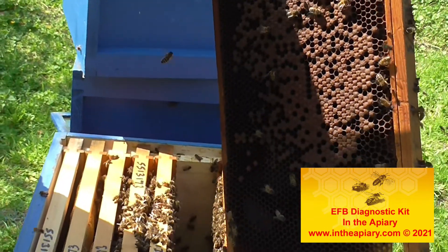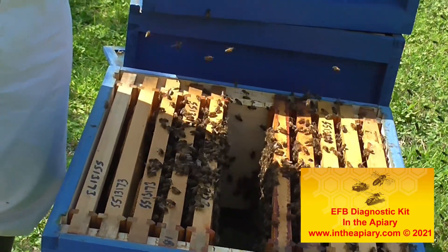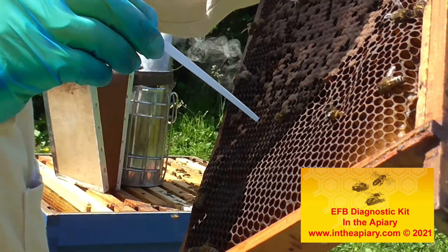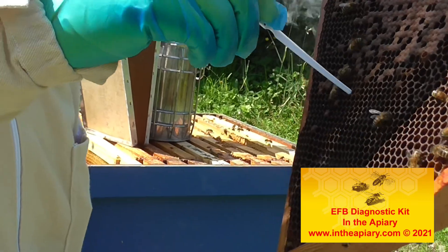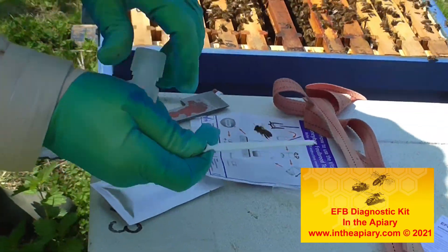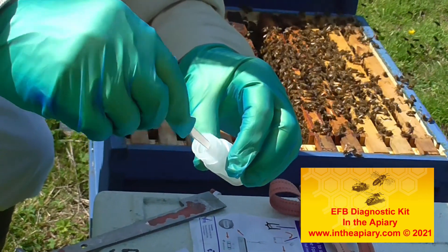What you have to do is use this little probe — I call it a feeler gauge at the moment. What I'm going to do is just put it in a cell with a larva in the bottom, and then put that in the fluid and wiggle it around.